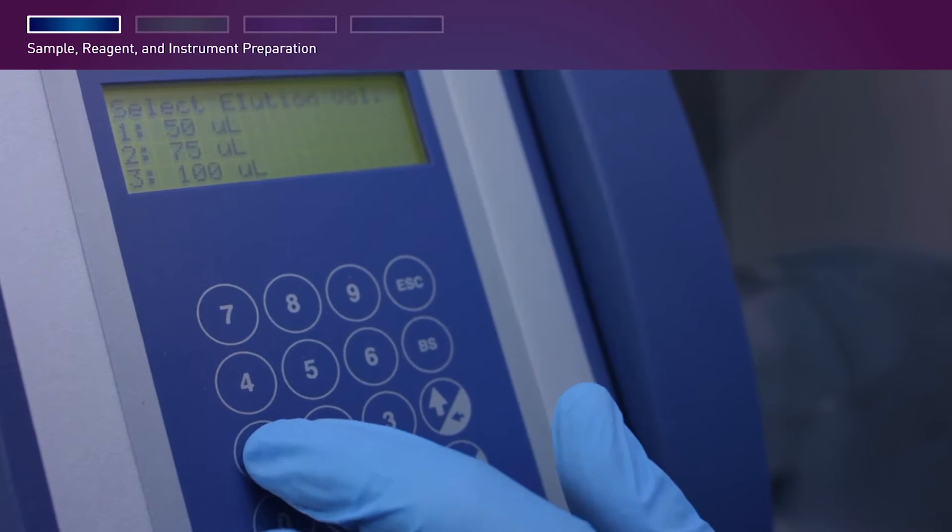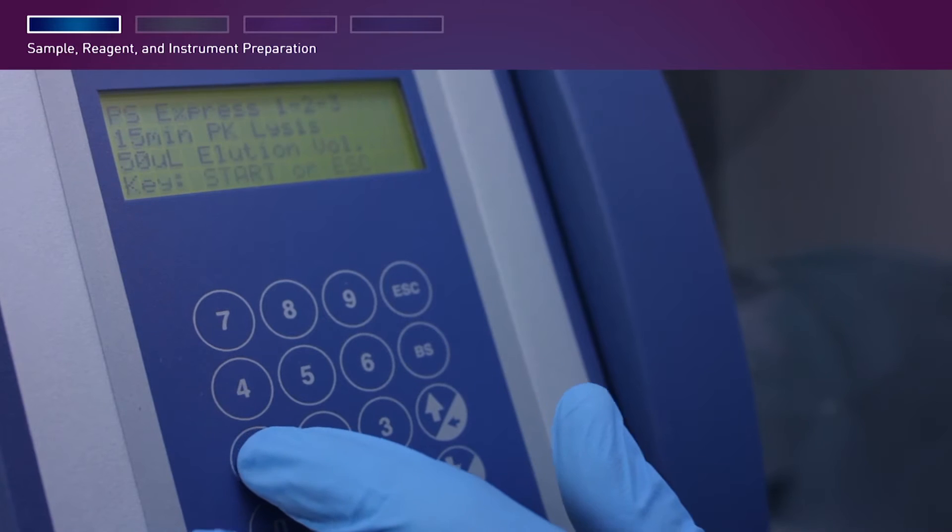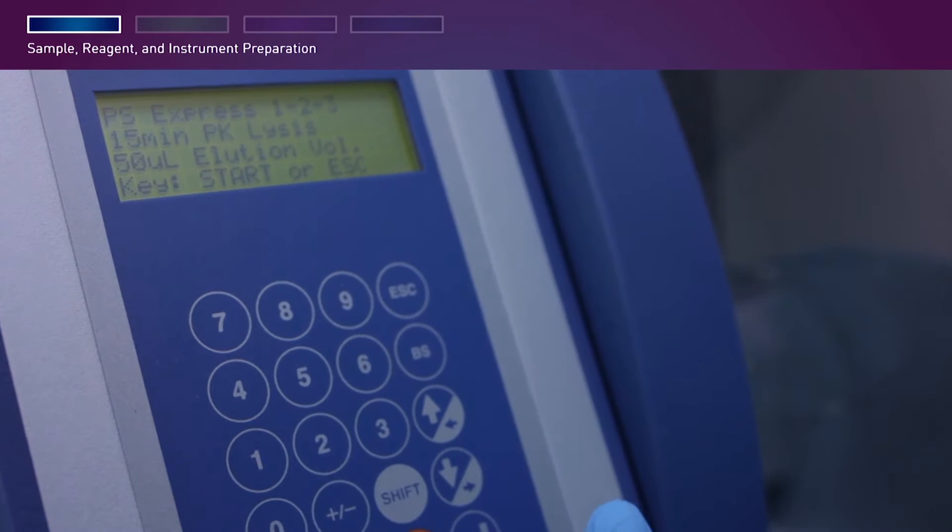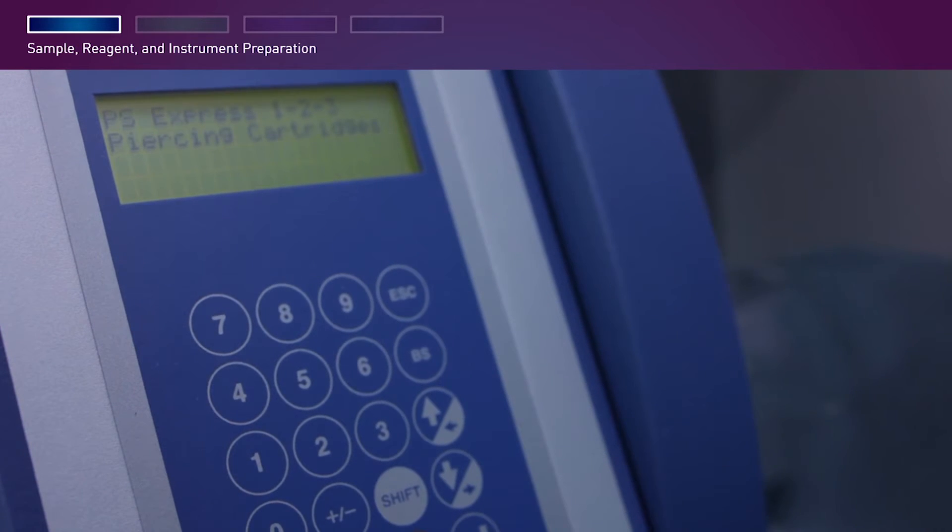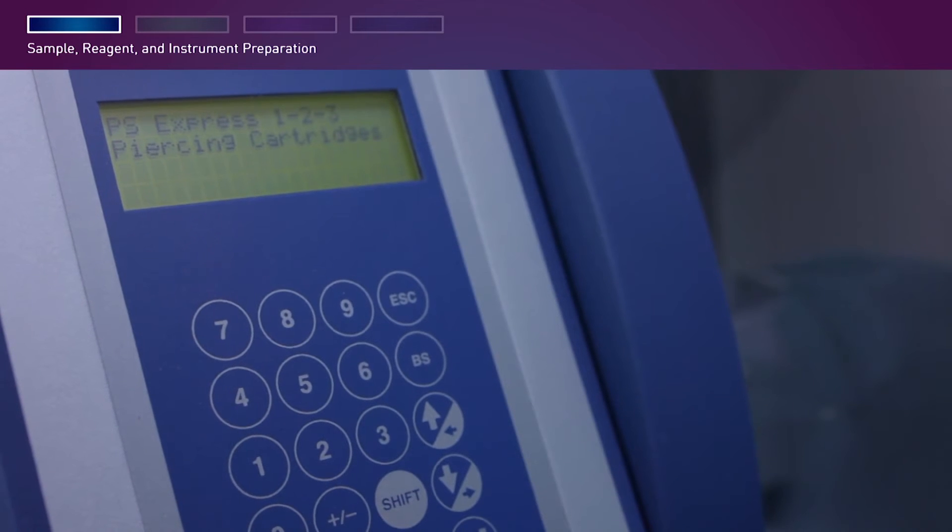Select the lysis time, select the elution volume, then review your selections and press Start. The screen shows the steps and the approximate runtime remaining.